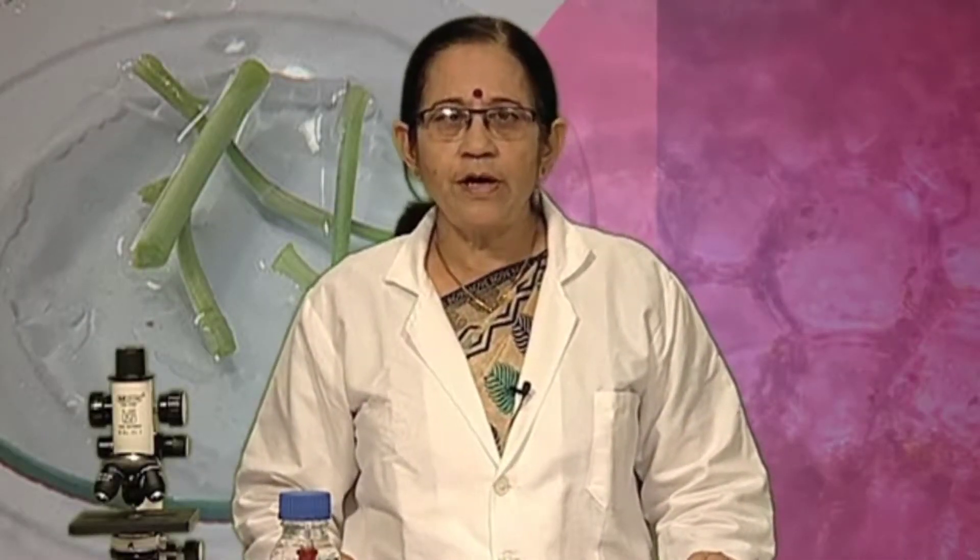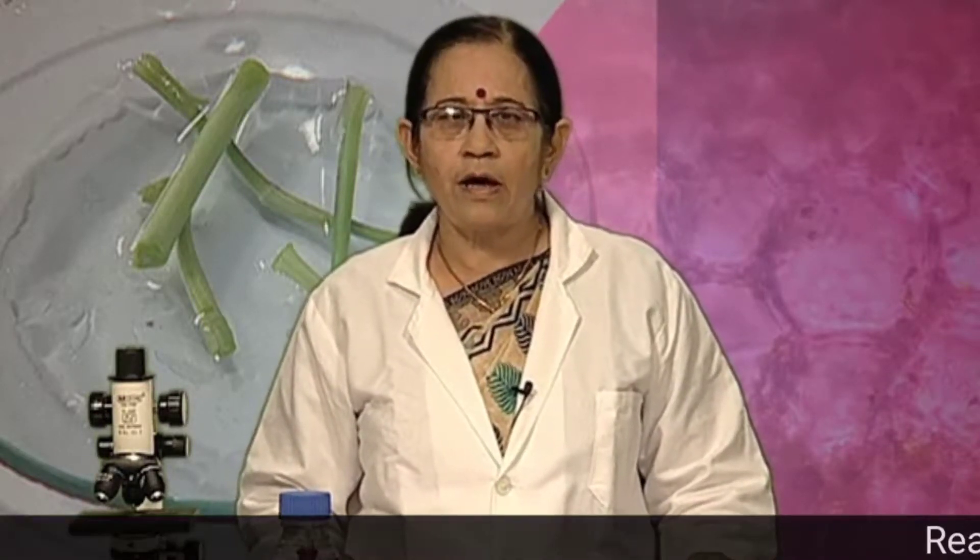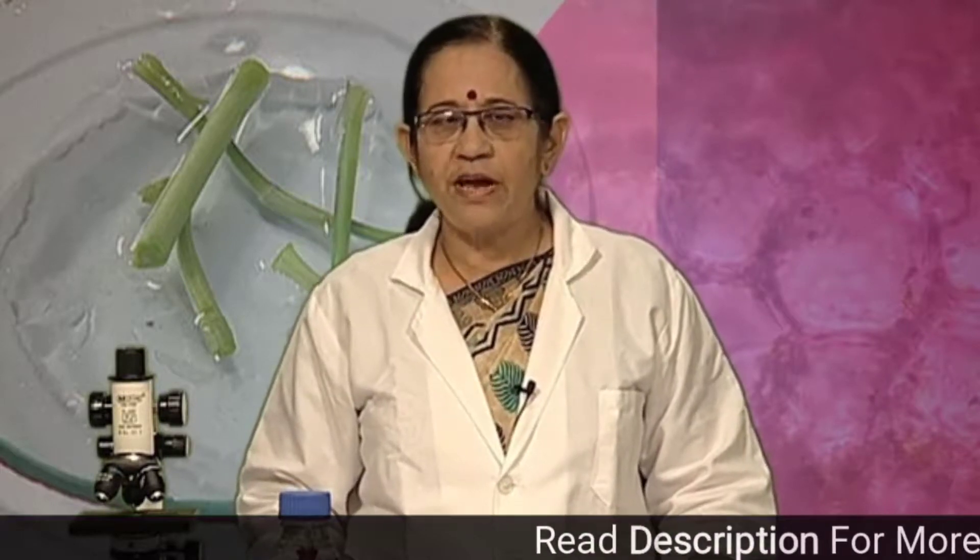Today students, we will be studying about parenchyma and sclerenchyma in a temporary stained slide.